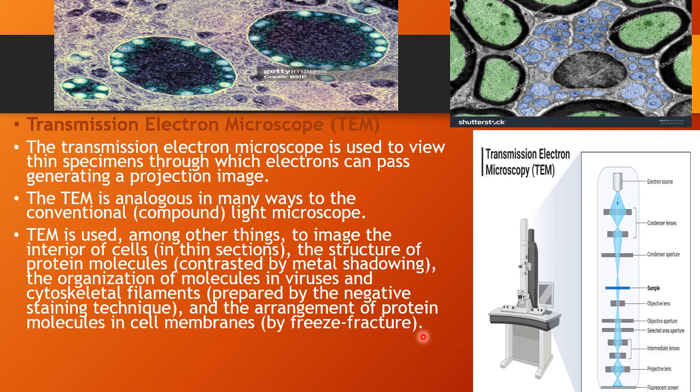It can also be used to see objects as small as protein molecules, and you can even visualize them at the nano level. It also provides the details of the internal composition of the cell or any suitable material under study. Here, the image is produced by detecting the primary electrons transmitted from the sample. We use primary electrons here. Fine, so this is the transmission electron microscope.